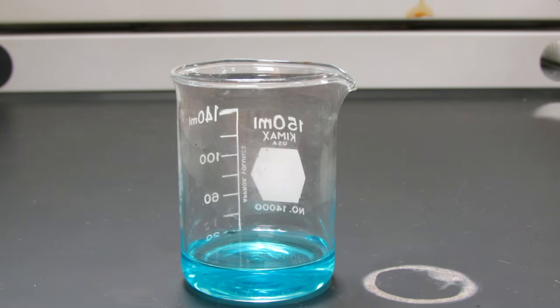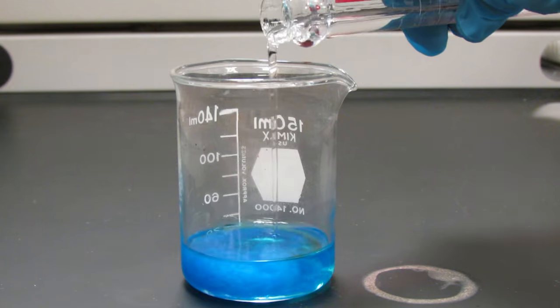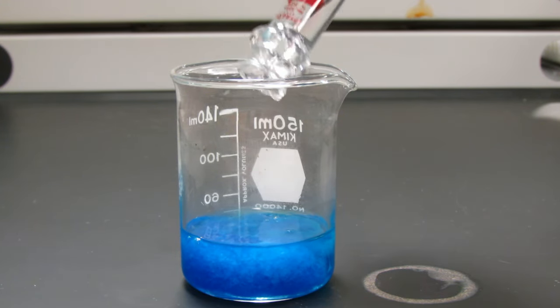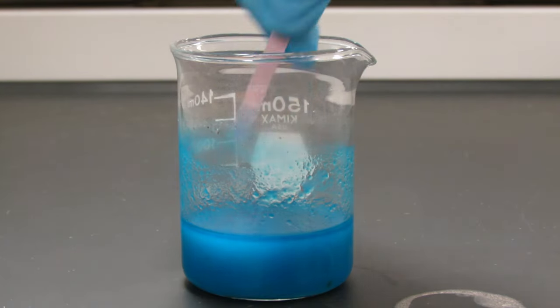You can see the light blue copper nitrate that is formed. Now add 20 milliliters of 6 molar sodium hydroxide to the copper nitrate. You can see a dark blue precipitate of copper hydroxide. Stir this up to make sure that it's all reacted.